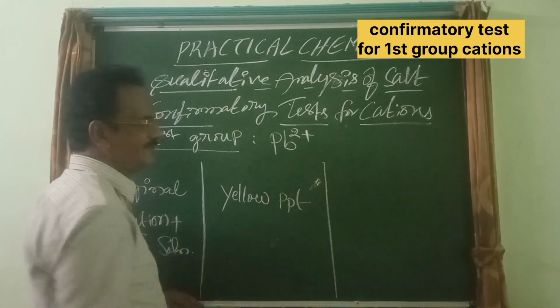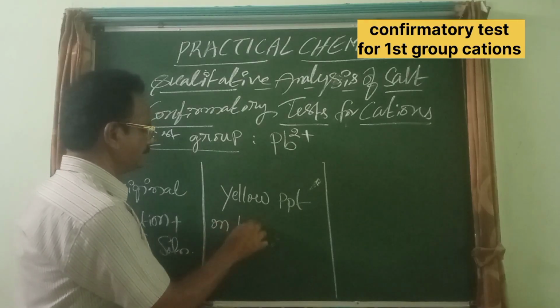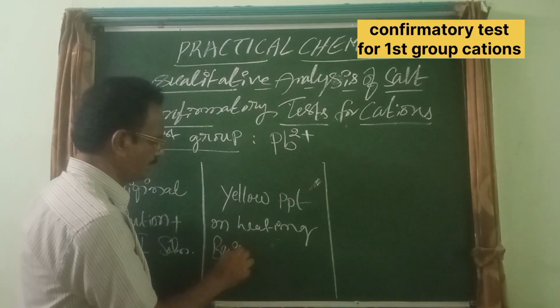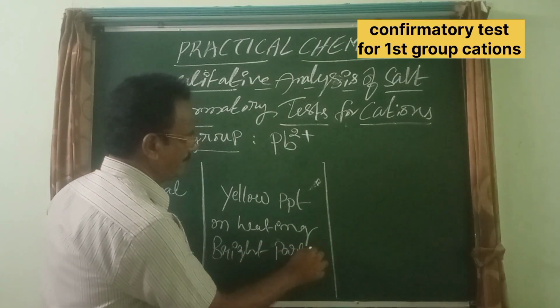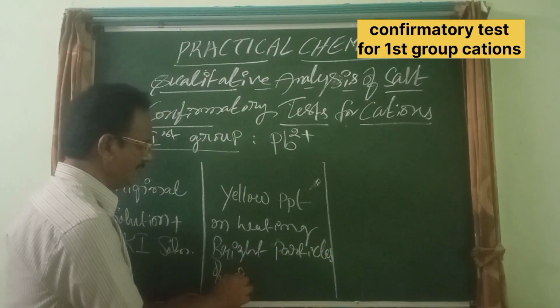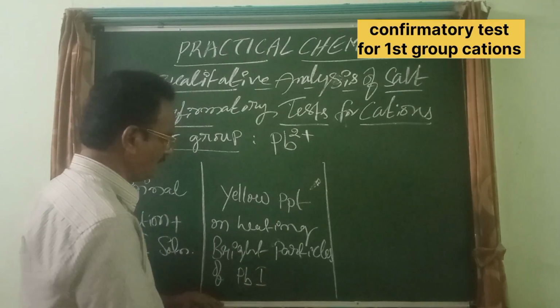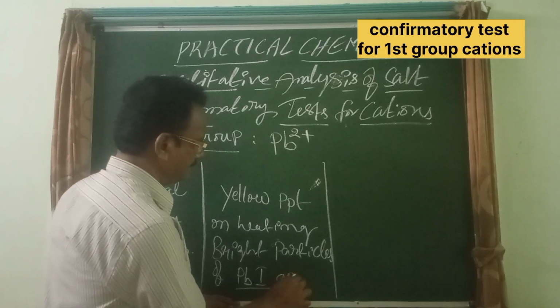Okay. On heating, keep in mind, bright particles of lead iodide, PbI2, appear.